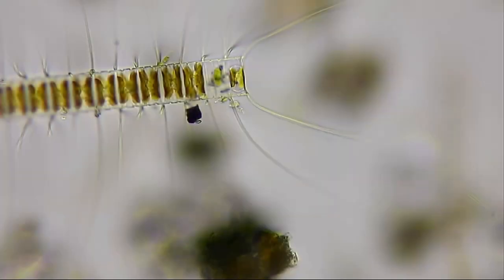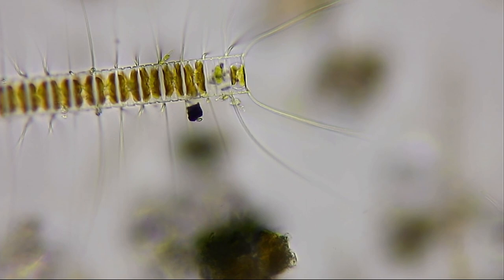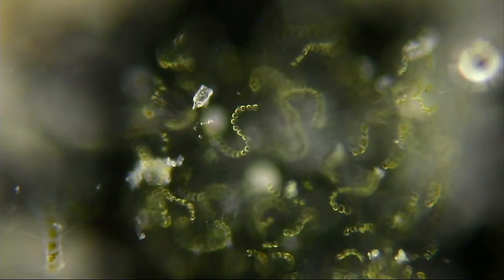While diatoms are single-celled algae with cell walls of silica, like glass, they are a major component of the phytoplankton. I noticed a slight shift in the chain-forming diatoms this week, less Skeletonema and more chains of the diatom Chaetoceros, like this Chaetoceros socialis.